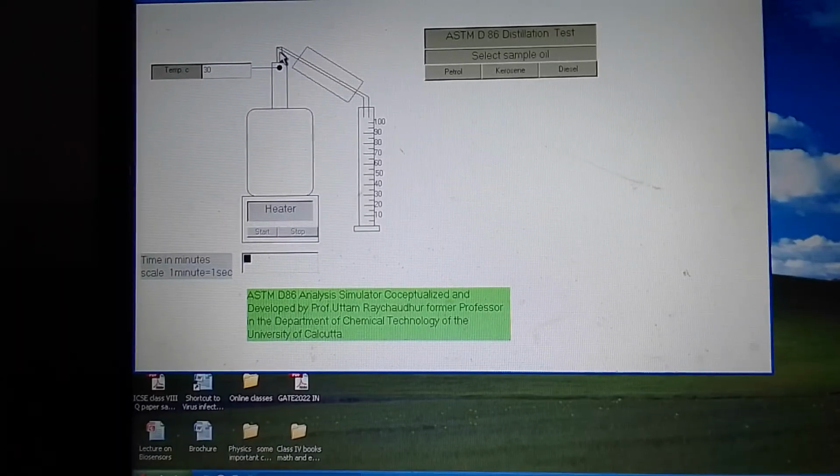It could not be shown properly, but it is a gooseneck which is uniformly used for tubing through a condenser where cracked ice and cold water is circulating, and whatever drops are formed after condensation are collected in a measuring cylinder which is marked up to 100 cc.